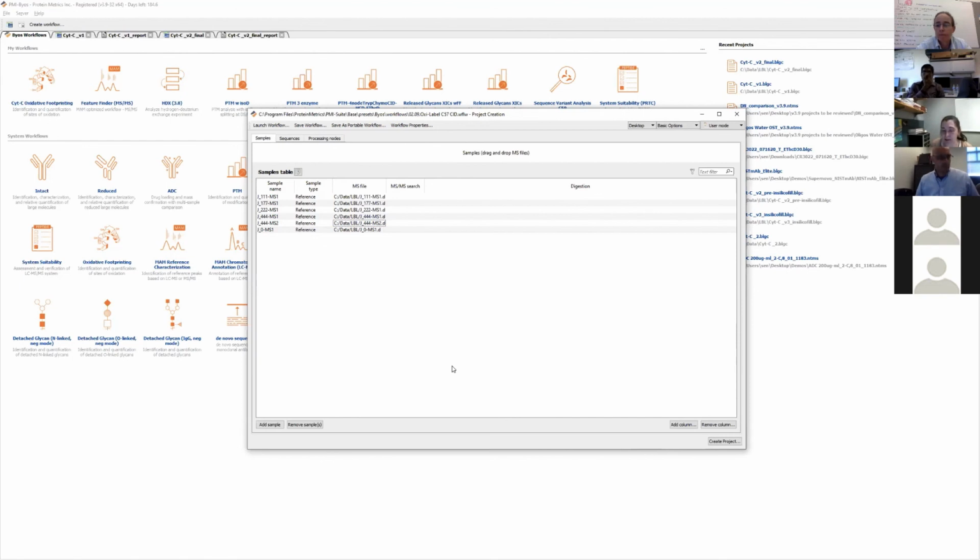Does it process ion mobility data from Bruker? Good question, Jana. Yes, there is specifically a column that reads out the timsTOF ion mobility value. We don't use it for pre-discrimination, but you can use that number in the report to go and apply discrimination by ion mobility. Can you quantify this data as well from ion mobility using the software? Yeah, the quantification is exactly the same process as for any other data, giving all the caveats for quantification by mass spectrometry, of course.